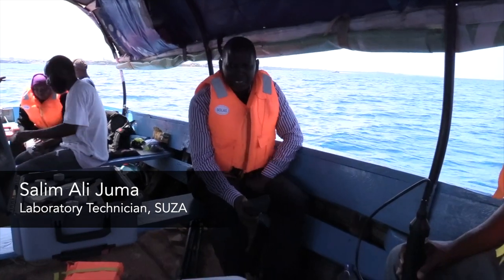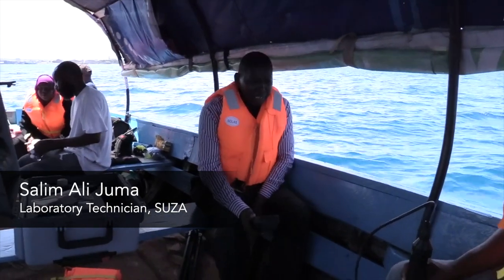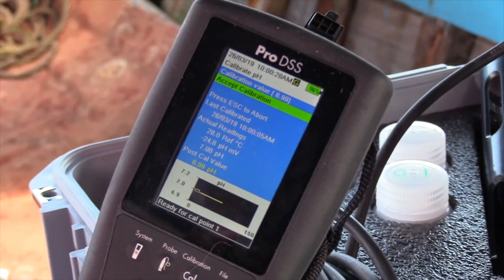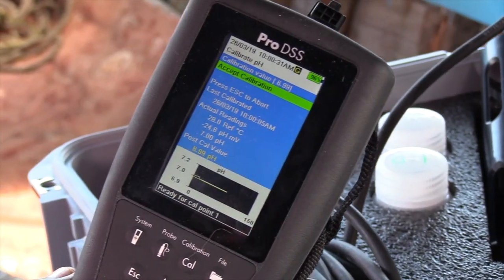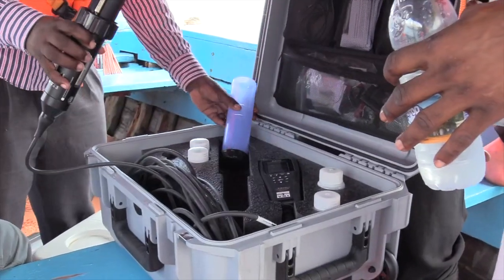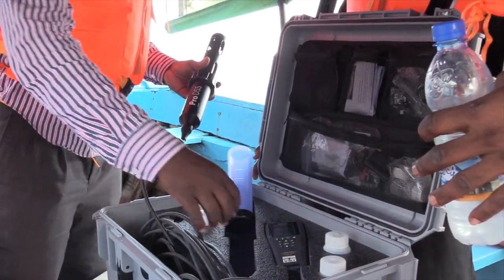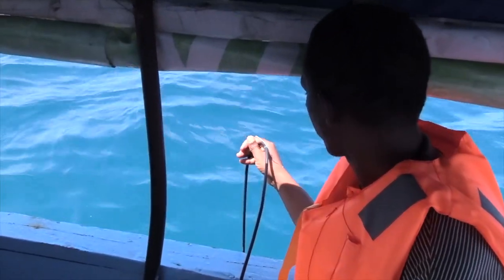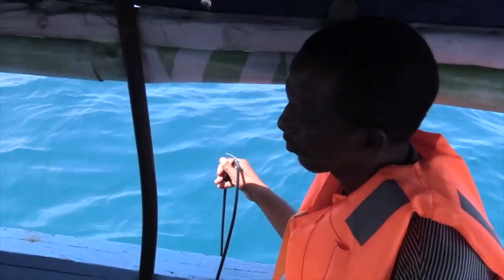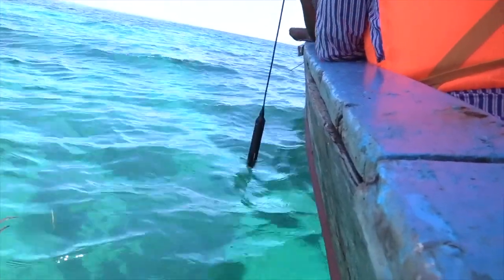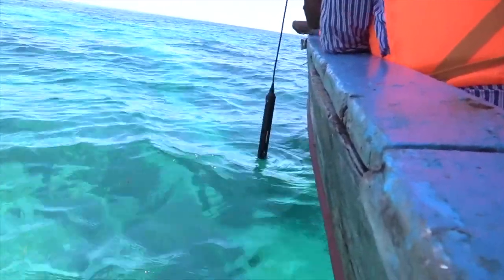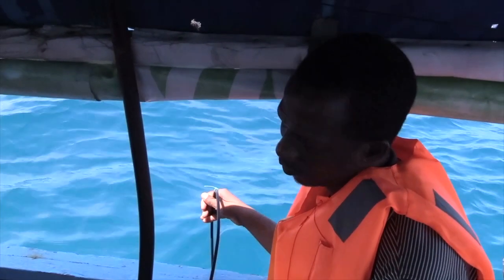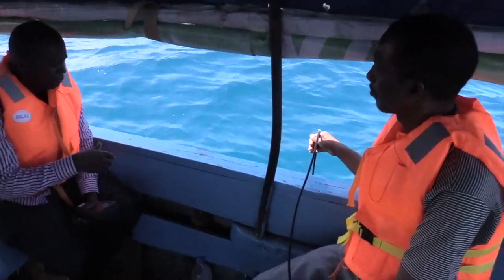Here we are at the next station and we are going to take measurements of different parameters. We have our multi-sonde instrument here — this is the computer part and that is the probe. We have to insert the probe into the water, starting at the water surface and then moving it down to approximately five to ten meters. Sampling is now in process.